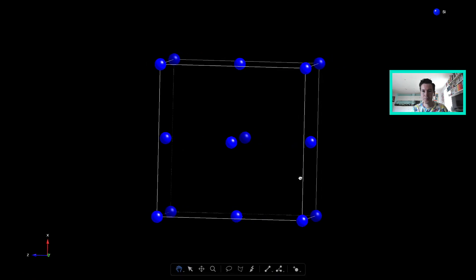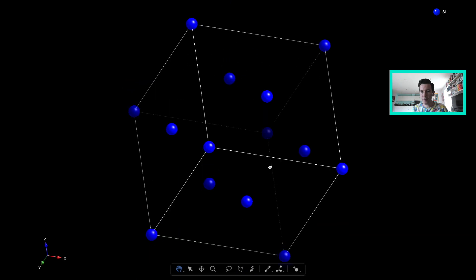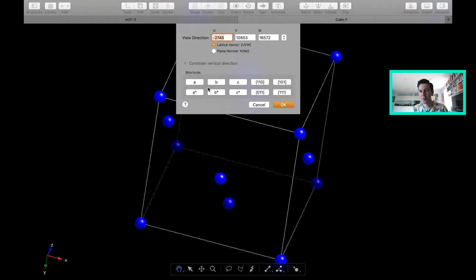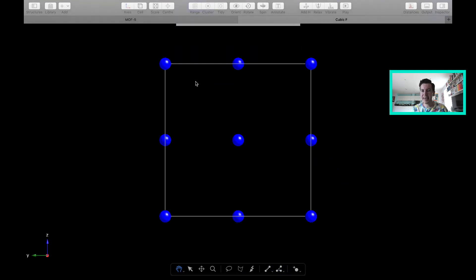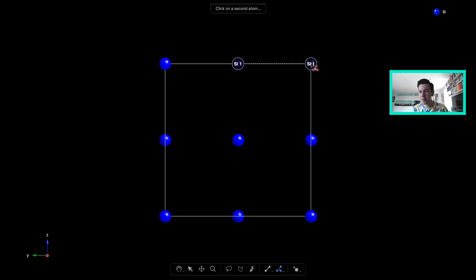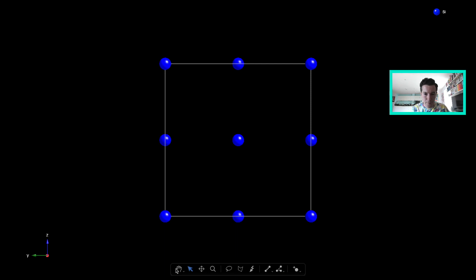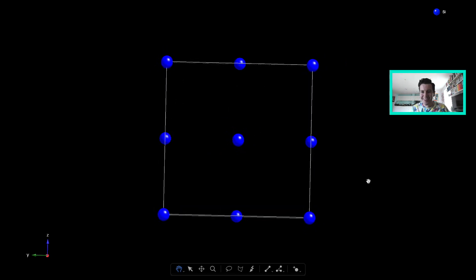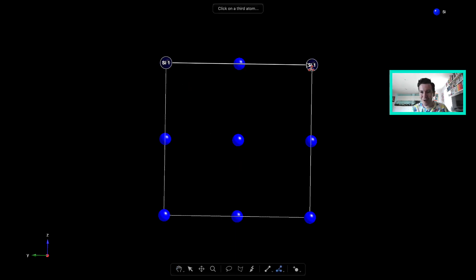Here is a unit cell of a face-centered cubic lattice. If you rotate it too much and want to get it back to a nice orientation, you can click Orient, click A, and it puts it through the A axis. I can measure angles — let's see the angle between these three atoms. It shows 60 degrees — that's because of the 3D nature. If I choose the corners instead, there we go: it's 90 degrees. You can measure many distances — 3.5 angstroms, for instance.